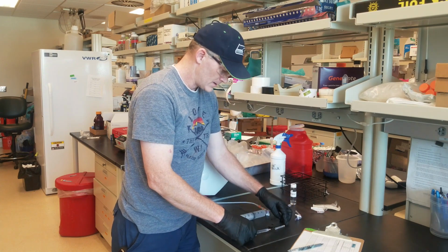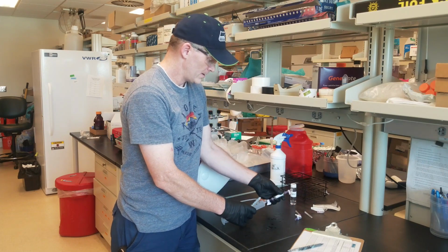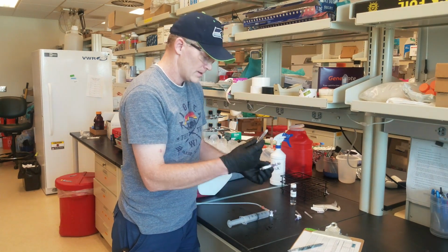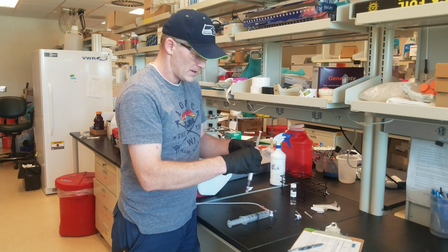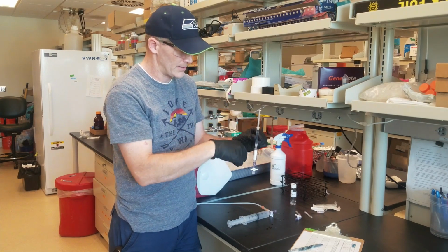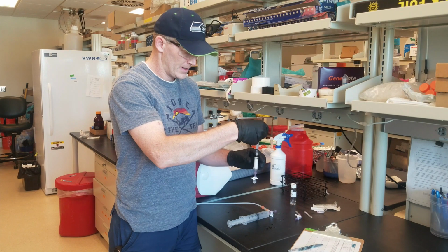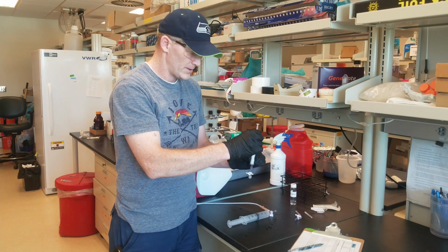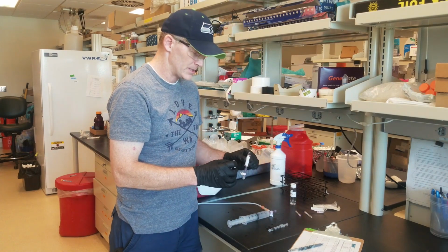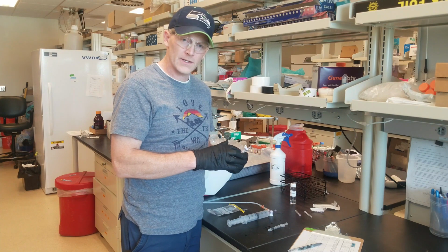Now, I'm going to get the needle off the end of the syringe. And here, now you're going to take the Sterivex off of the three-way valve. Connect that on. Now the key here is to have this going in this direction. So the syringe is pointing into the Sterivex, pointing down towards the ground. If you do it this way, you can easily push the RNAlater in. You'll feel some resistance. Once you've filled it, you can take the syringe off. And again, we'll be sending caps along, but as for demonstration, here, you then put the top cap on. With the top and bottom cap, the Sterivex is sealed.